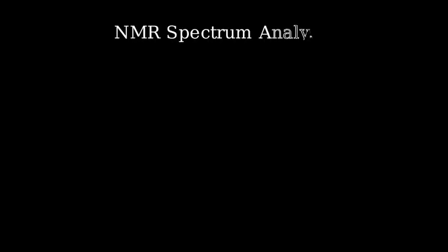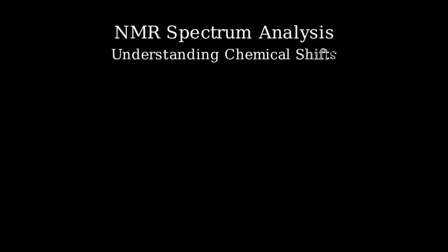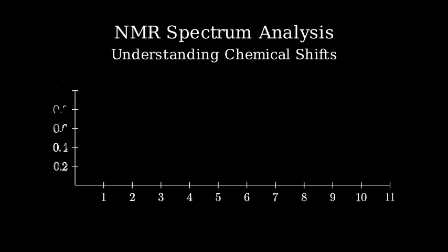Welcome to our lesson on NMR spectroscopy interpretation. Today, we'll analyze this proton NMR spectrum and correlate it with the molecular structure. Let's look at the NMR spectrum.